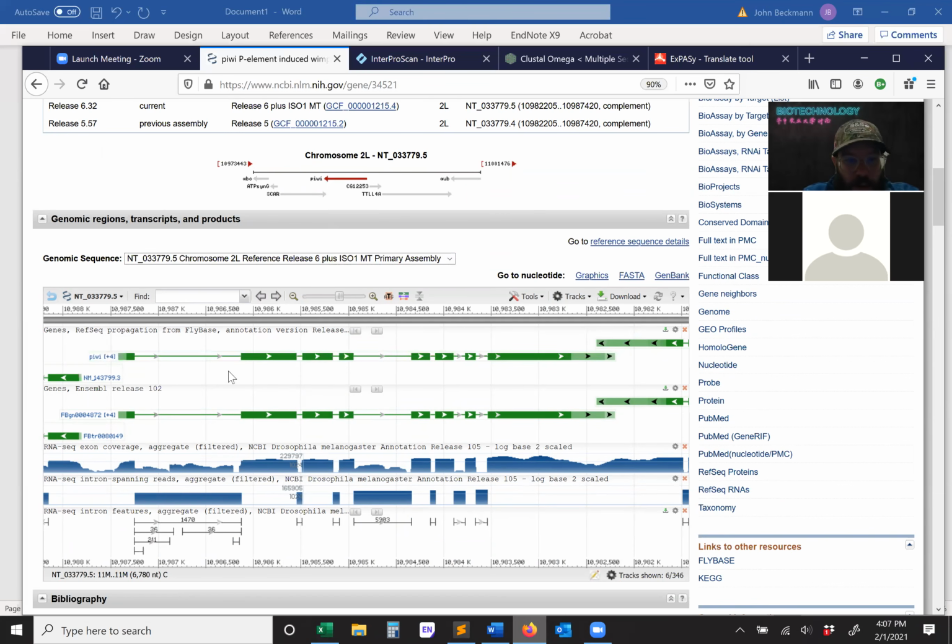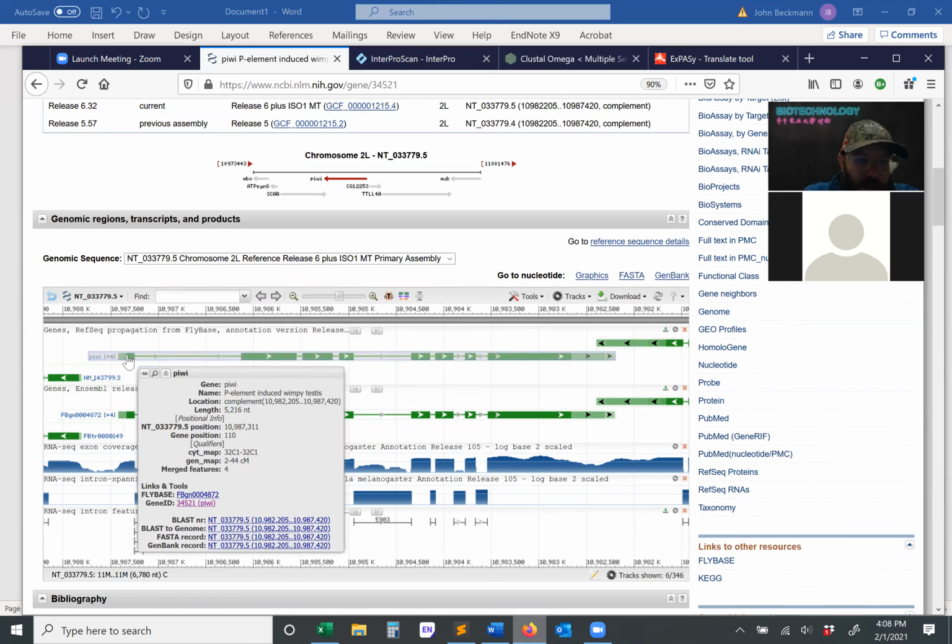Okay. So the green things, this is a eukaryotic gene. I can tell it's a eukaryotic gene because I can quickly see these dark green boxes. These are the exons. So this gene has 1, 2, 3, 4, 5, 6, 7, 8 exons. Maybe these lighter ones, I'm not sure what these are. These might be alternatively spliced exons, or it could be the terminator. Looks like this is a promoter region, this light green thing, or it could be that this is the start codon. If we want to zoom in and look on this, let's zoom into this region.